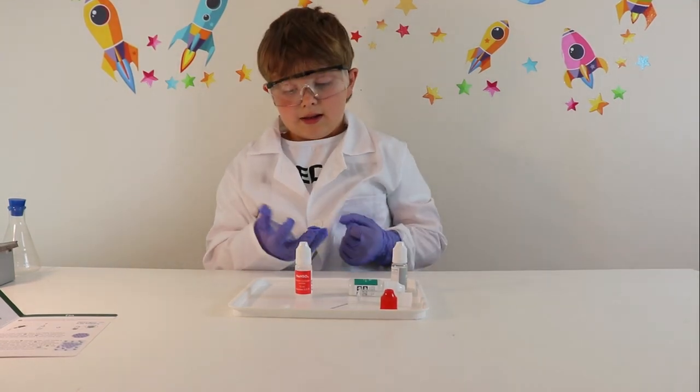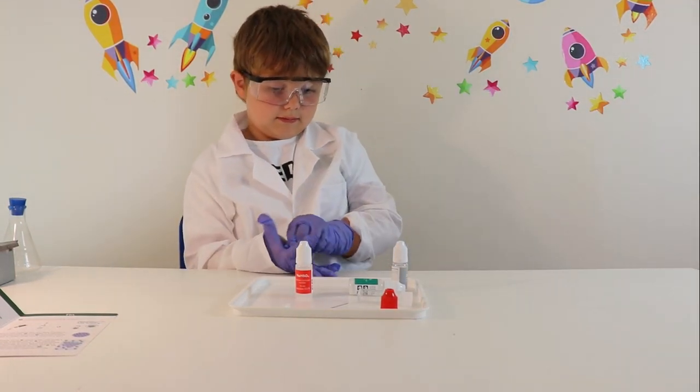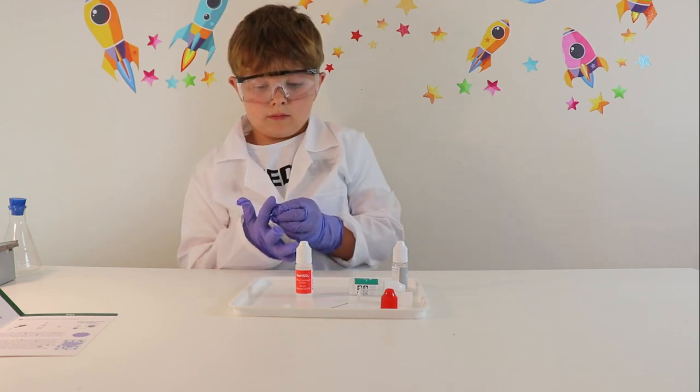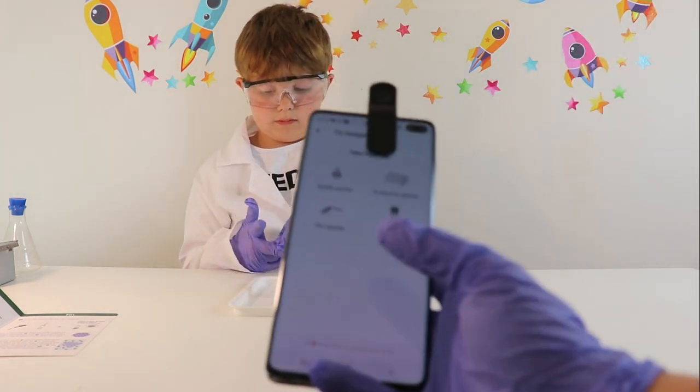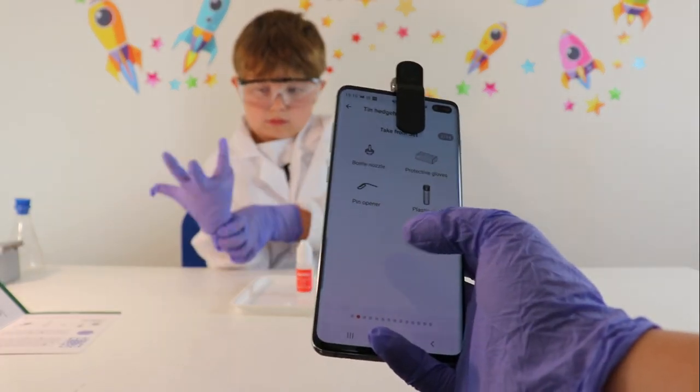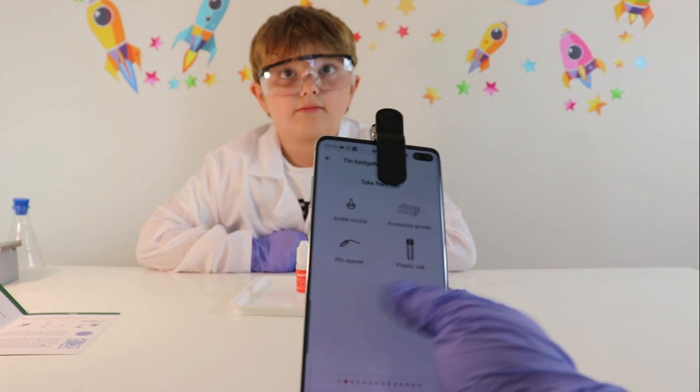Right guys, so we have got everything we need for the experiment. You can do it on the card, but I am actually testing it out on my phone and doing it through the MelScience app, because there are instructions on what to do. So we've got everything that we need.